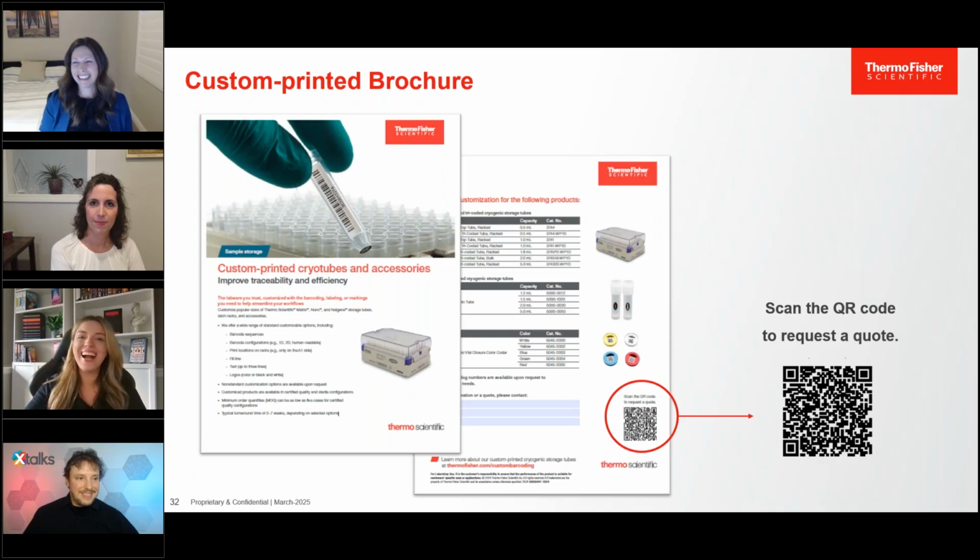Yes, you can absolutely add custom automation. A lot of times, especially if you are starting from scratch and you have no automation whatsoever, start with some of those smaller semi-automated units just to get your foot in the door with automation and start getting away from some of those hand labeling practices. Many of those semi-automated applicators are just attachments onto standard thermal transfer printers, so it's really easy for labs to start incorporating those, because it essentially starts as just downloading a print driver and using it the same as you currently are with thermal transfer printing.